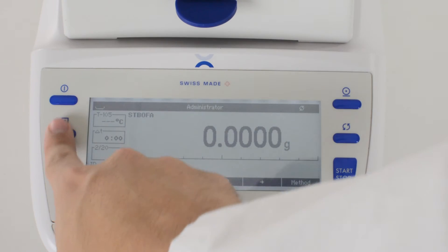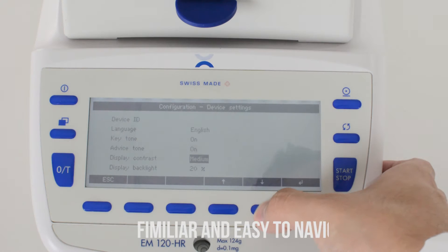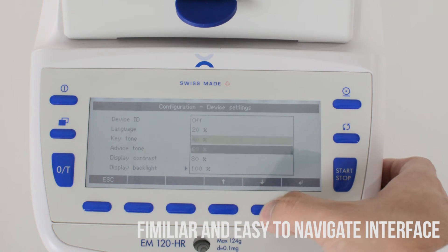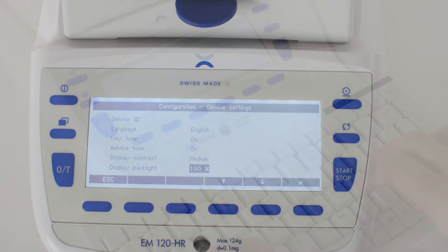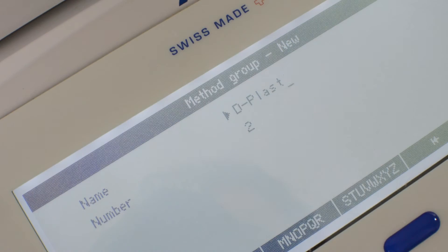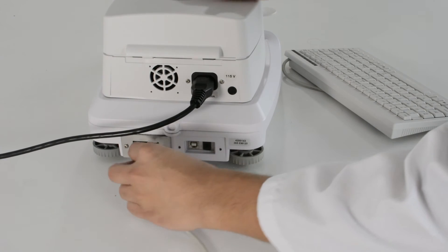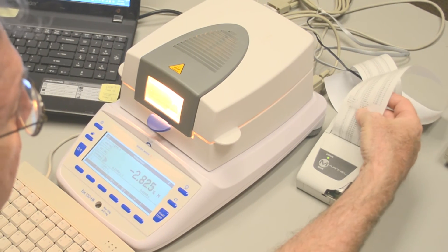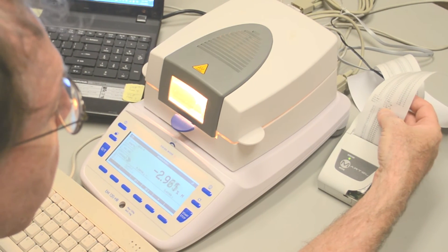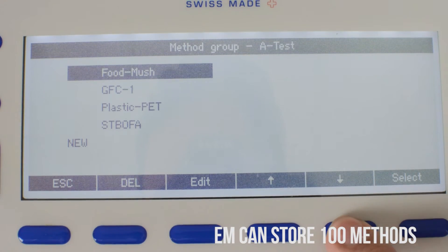The EM120 has a menu-driven graphic user interface. The interface is easy to use with its familiar scrolling navigation and drop-down menus, making method development easy. For even more efficient method entry, a USB keyboard can be plugged in with no special installation needed. The keyboard, printer, and a PC can be plugged in and function simultaneously. The EM is capable of storing up to 100 methods.